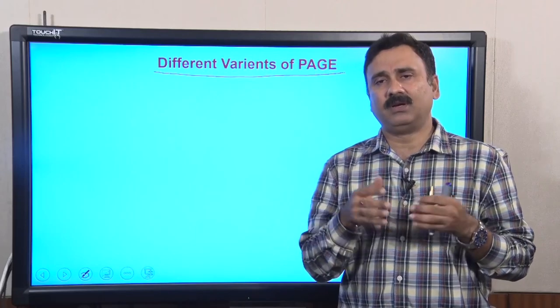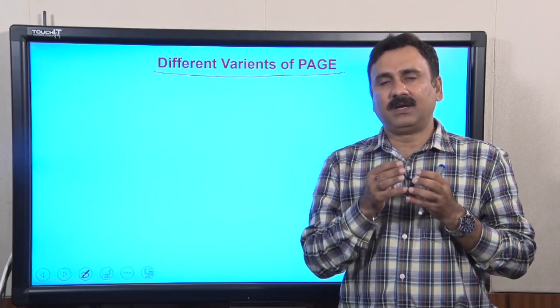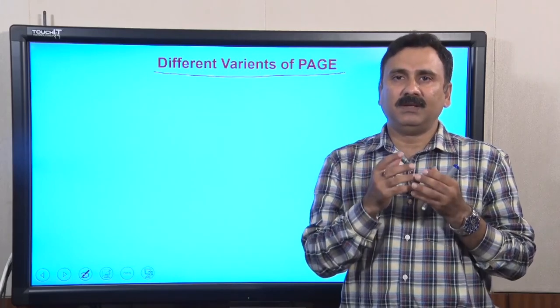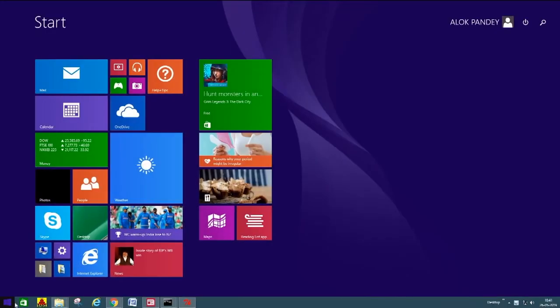In this particular clip, we have discussed the technical detail as well as the steps you have to follow. In this video, we will show you how to analyze a particular band of interest from SDS or agarose gel electrophoresis gels using ImageLab software. So here I will show you how to open the ImageLab software and how to analyze different components.